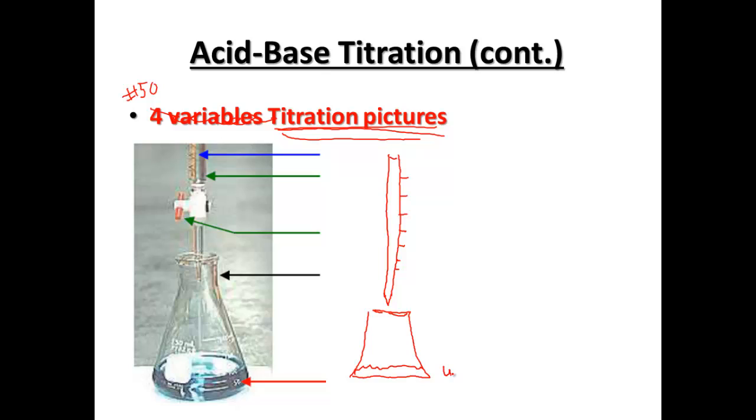We're going to find this unknown concentration, because what we will know, this is going to be our known concentration in here.